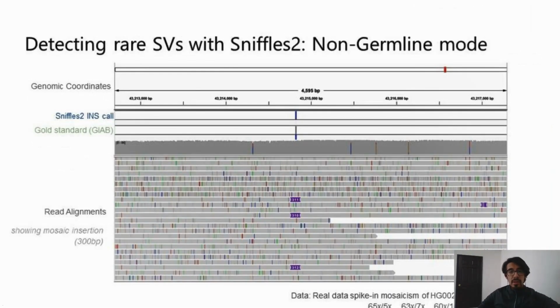So first, here we show you a benchmark dataset. This dataset is 70x coverage and contains mostly reads from the mother. So we have here created this benchmark dataset with reads from the mother and a son. Most of the reads come from the mother, and we have spiked in various concentrations of the son. Both individuals share genetic background, however, there will be differences. And these differences will be some structural variants.